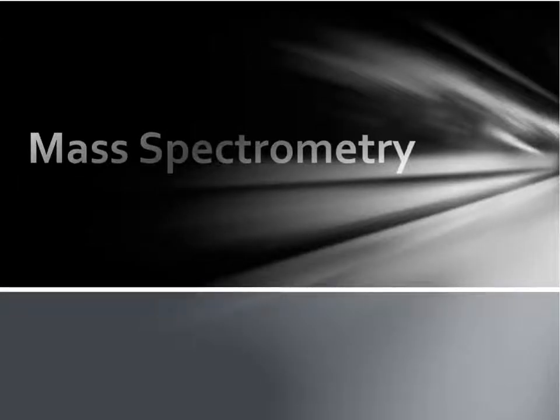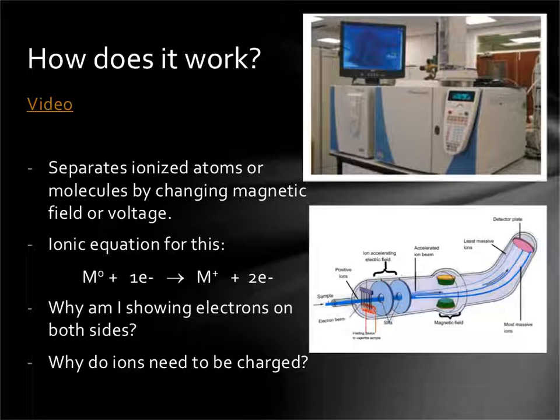All right, in this podcast, we're going to talk about mass spectrometry. Basically, I want to give you a little background and explain to you how to read them. All right, so basically, how does it work?